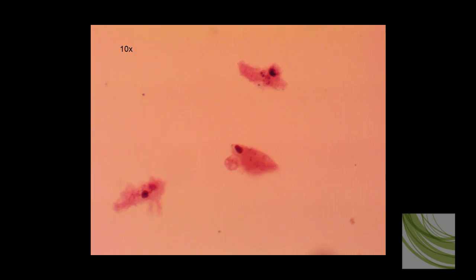Here is our second slide of the amoeba that we have here at the school, and we can see several of them scattered about here. Here is the same slide using the 10x objective. We can clearly see the nuclei and we can see some very delineated pseudopods.